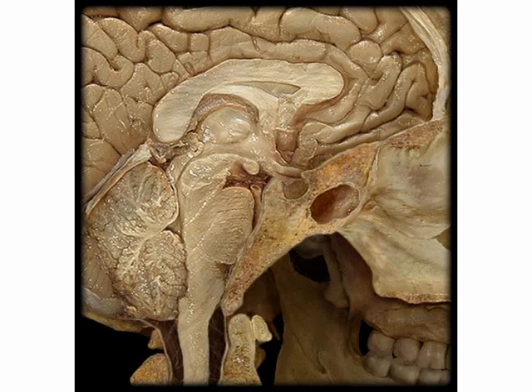Okay, so right now you should be able to see a sagittal view of the head, and in that you can see the pituitary gland, which is our first organ. I'm putting an arrow right here on the pituitary gland. You might remember from A&P1 that the sphenoid bone has a depression in it called the sella turcica.